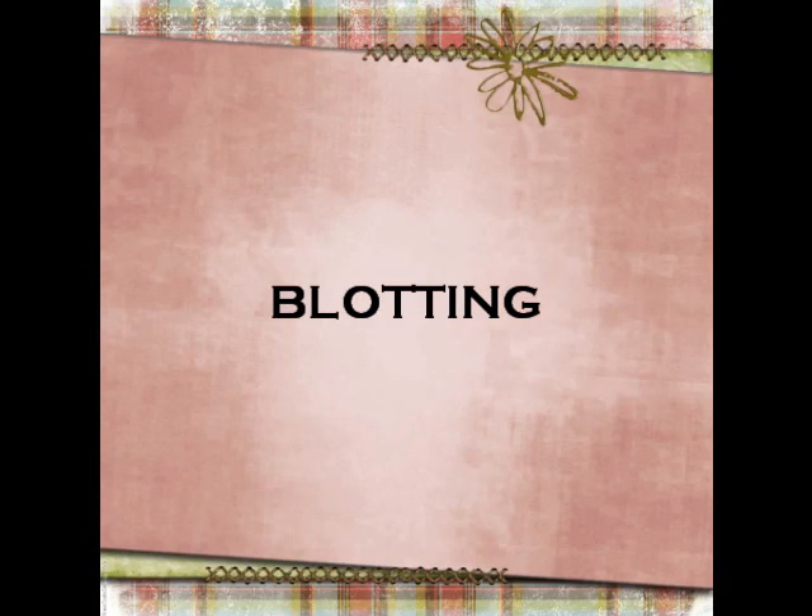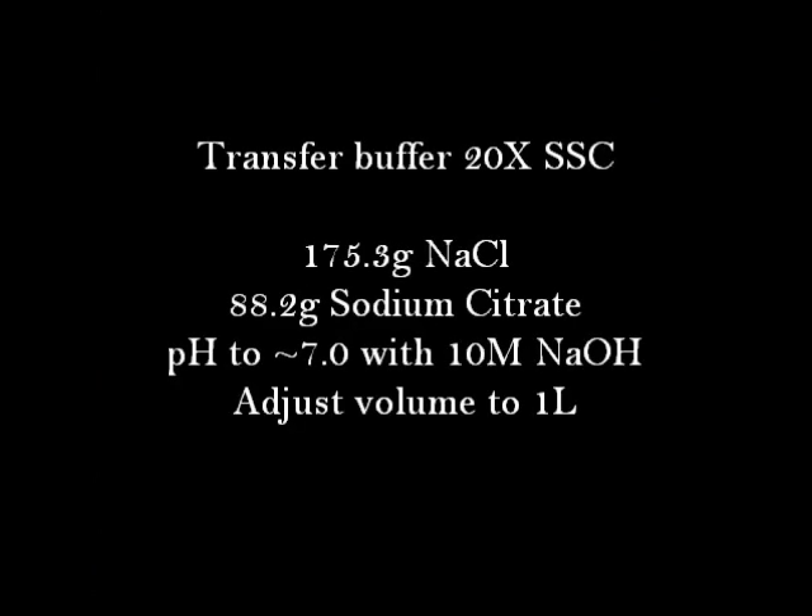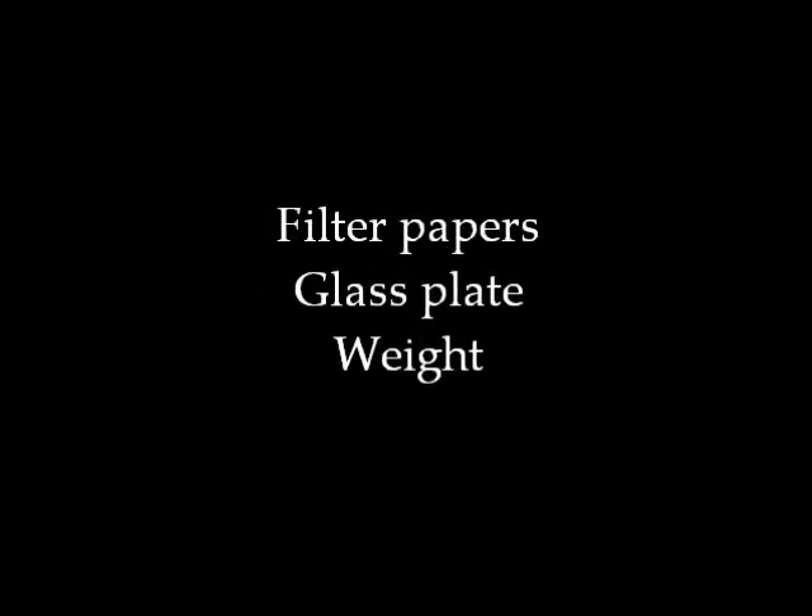The blotting procedure requires a trough, transfer buffer, Whatman filter paper, blotting paper, filter papers, glass plate, and a weight.